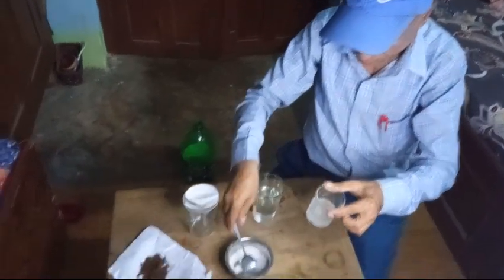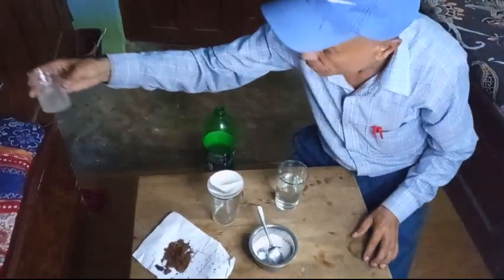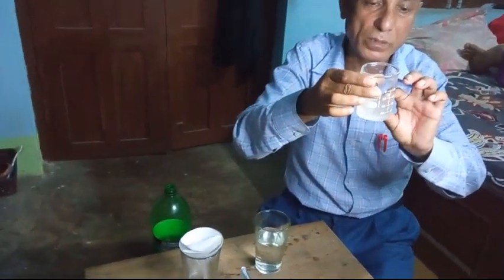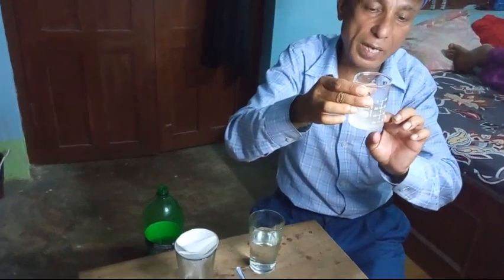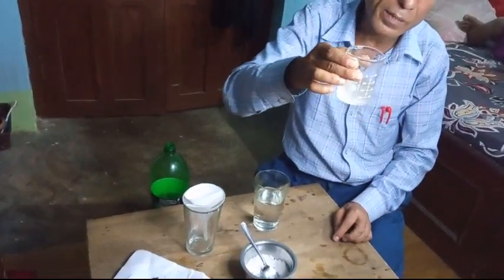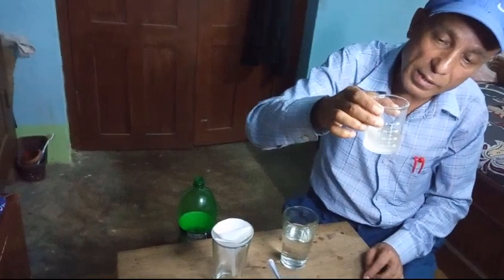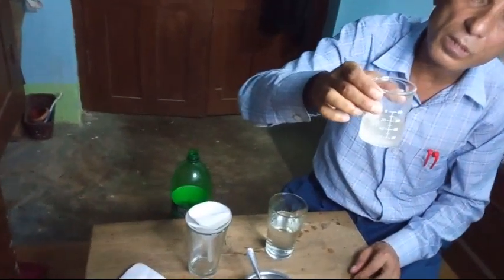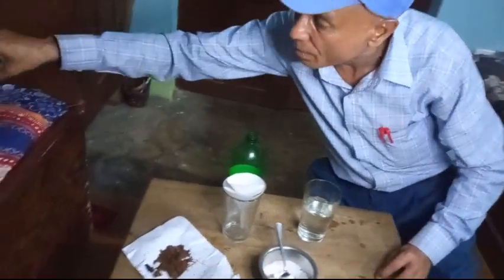Now I'll throw out the homogeneous mixture of salt and water from the glass beaker. Take some water in a glass beaker, add salt slowly and go on stirring it. It becomes a saturated solution after some time. Now I'll throw it out.